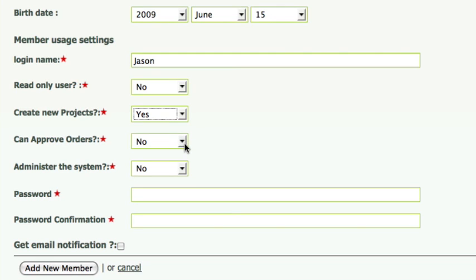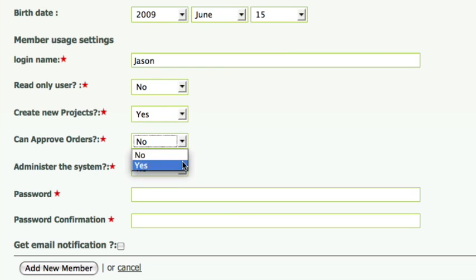Can approve orders. Jason will also be in charge of ordering the materials and equipment in the lab, so I'll choose yes. That means Jason will be notified when someone in the lab would like to order something. He will be the only member in the lab that has an ability to approve orders.